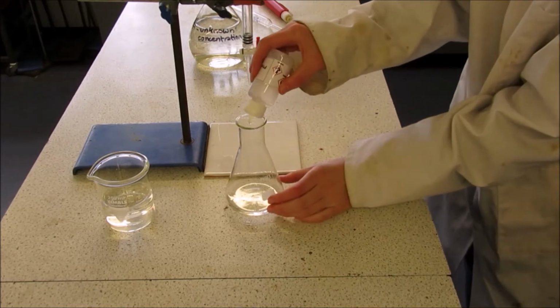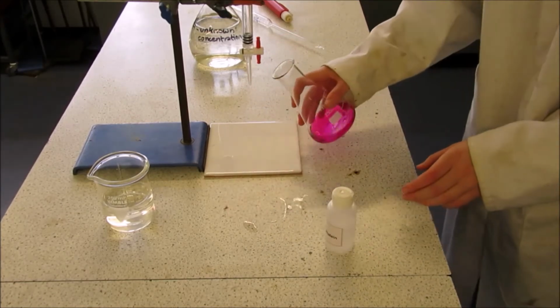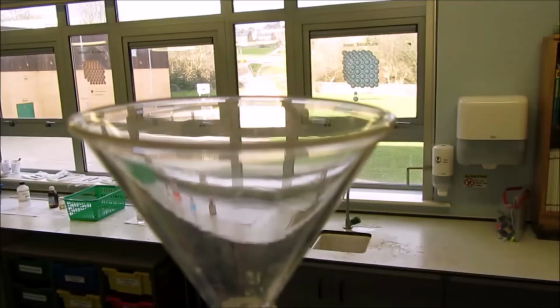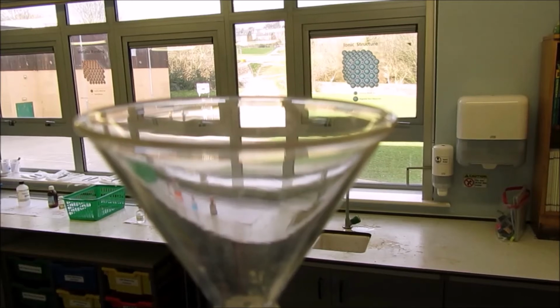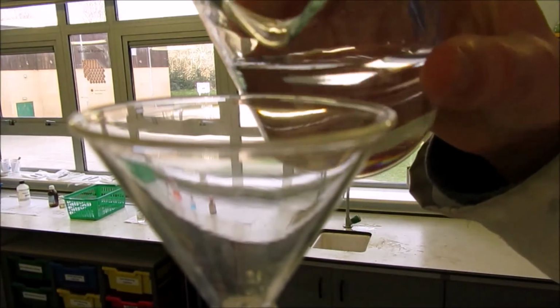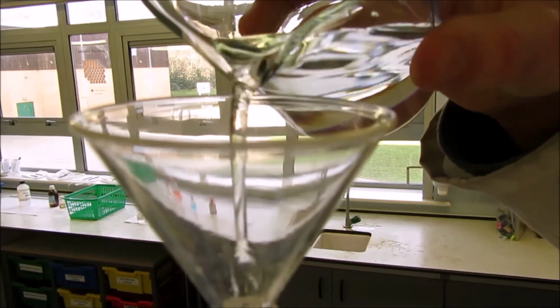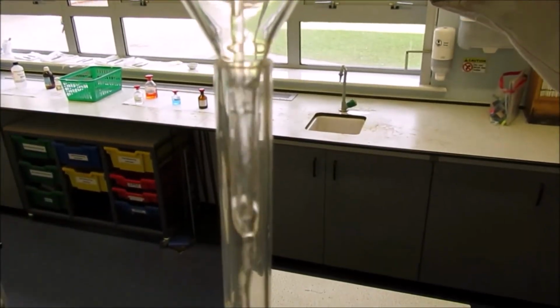Adding a few drops of phenolphthalein. Now write that down. Ensure acid is placed in the burette, as alkali can damage these extremely useful instruments. Now, ensuring the tap is closed, fill the burette with acid. A funnel should be in place to reduce the spillage potential.